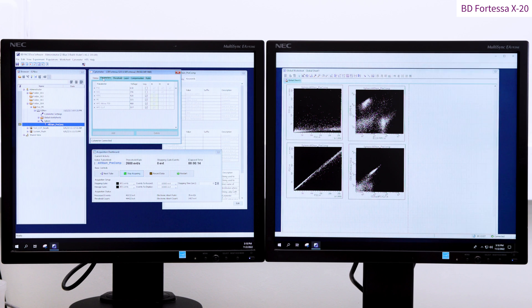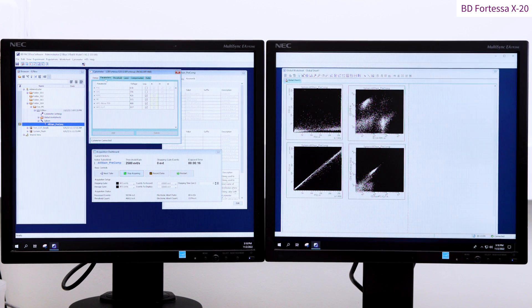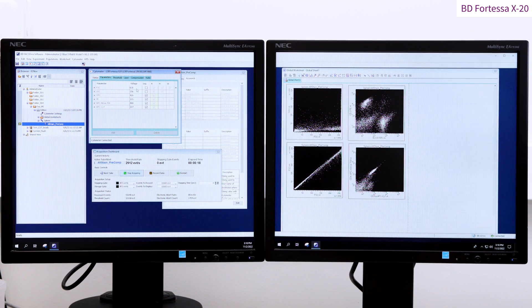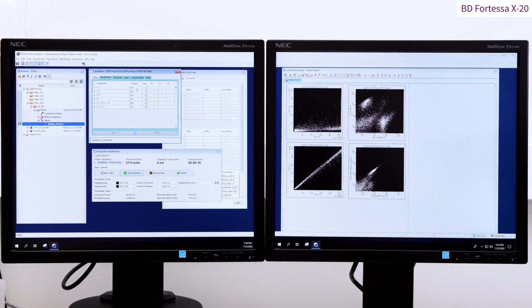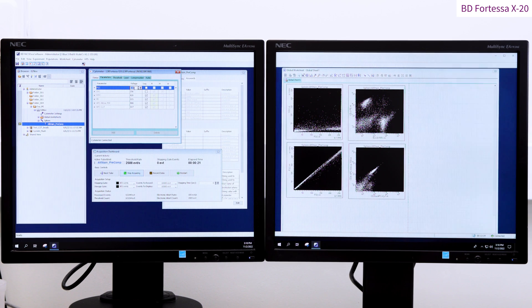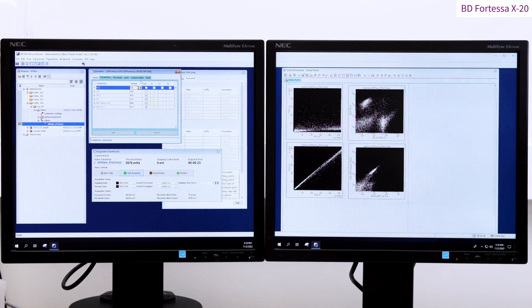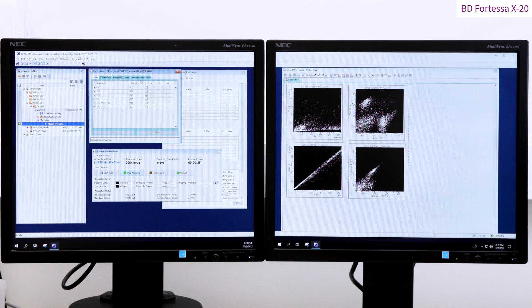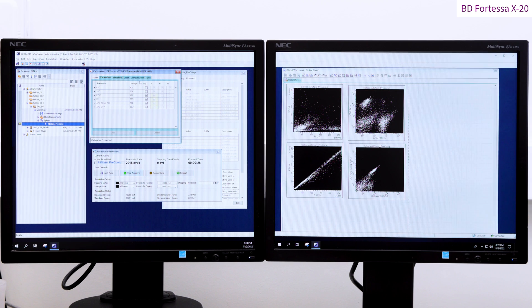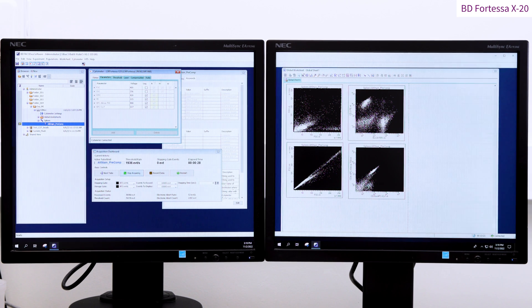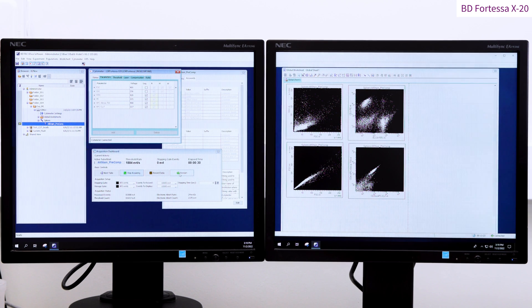We can clearly see here in the forward and side scatter plot that our Spleen lymphocyte population is off scale. In this case, it requires a reduction in forward scatter voltage found in the parameter tab. Press refresh and populations of lymphocytes and myeloid cells are now clearly visible.